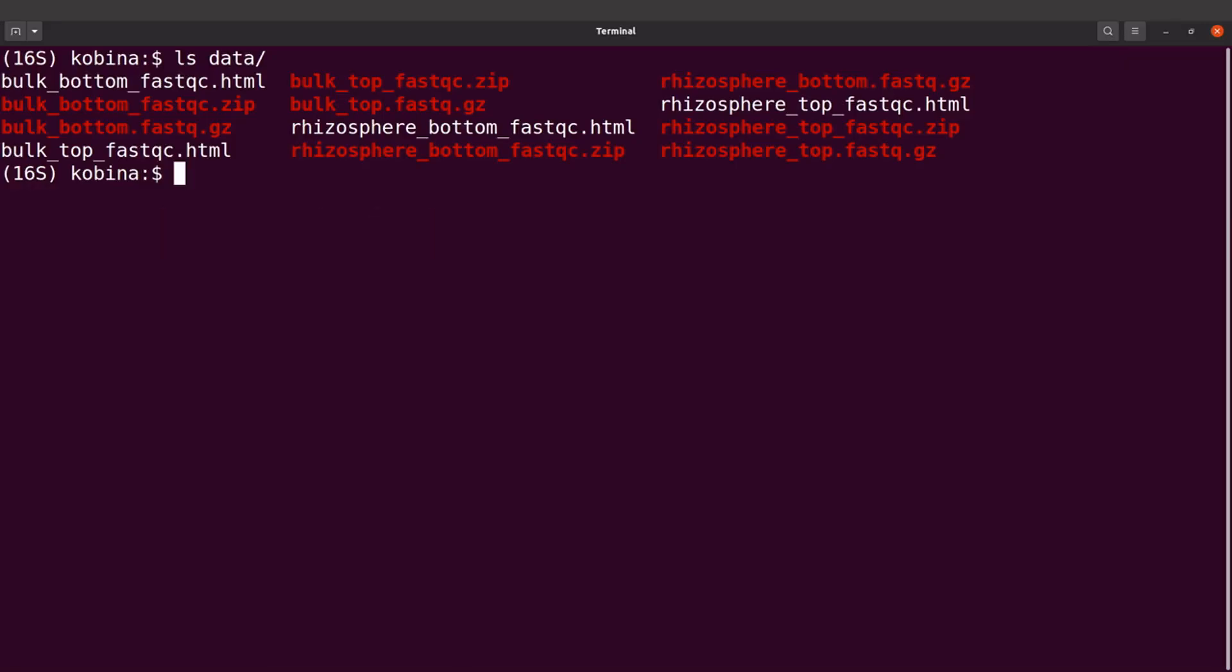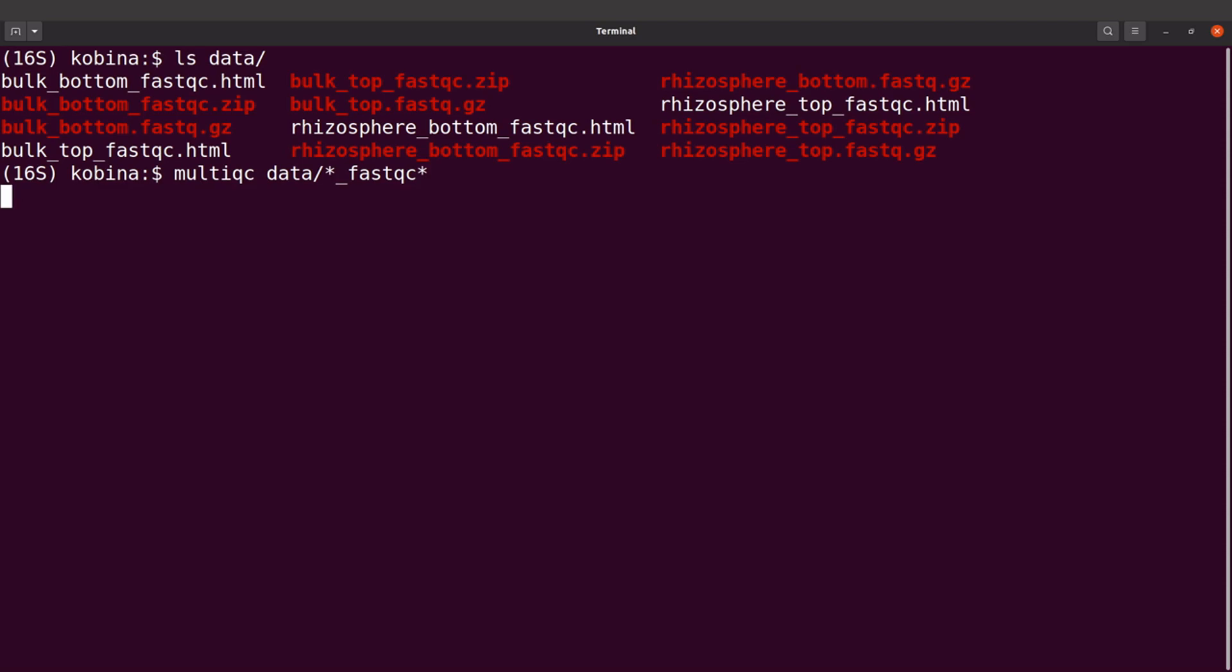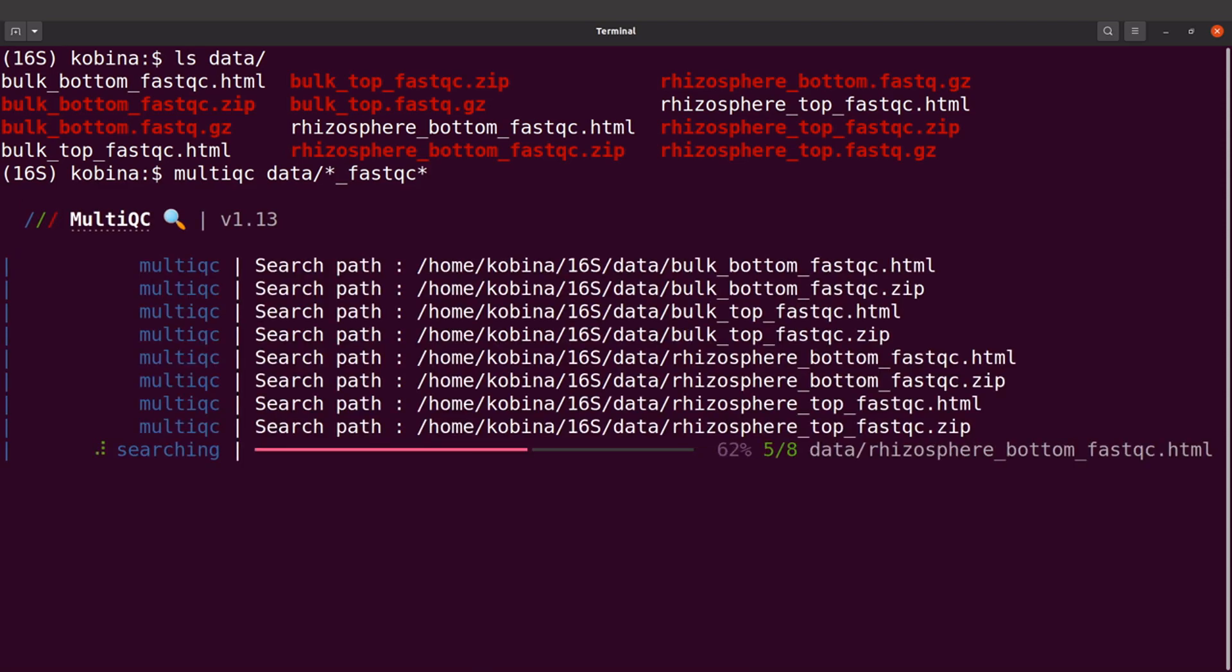To aggregate the fastqc report using multiqc, we will say multiqc and then data slash star underscore fastqc star. I'll execute the command. Multiqc will automatically detect other reports and aggregate them for us.